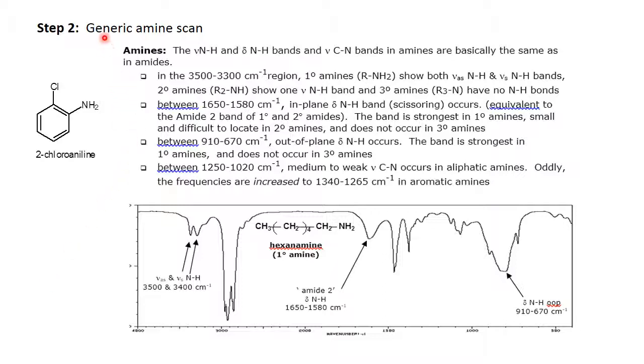Step two, let's examine a generic amine scan. So here I have the scan of hexane amine. It is a primary amine with two hydrogens bonded to the nitrogen and one alkyl group. Now for primary amines, they will have two NH stretches somewhere in the region of 3500 to 3300 wavenumbers, one for the asymmetric NH stretch and another one for the symmetric NH stretch.